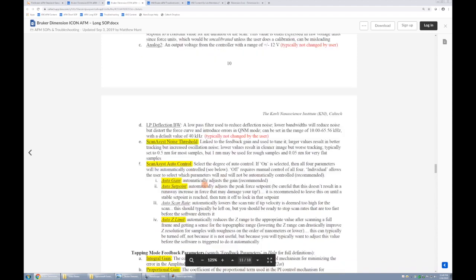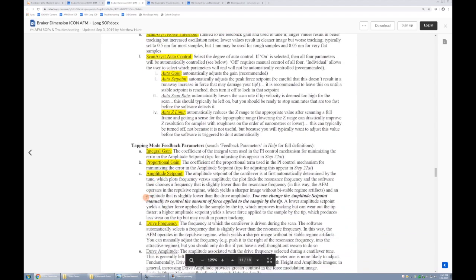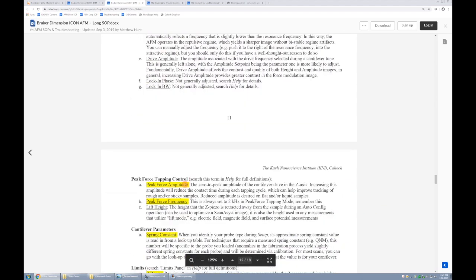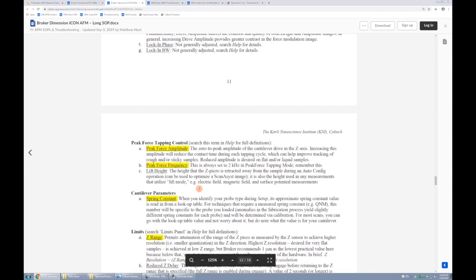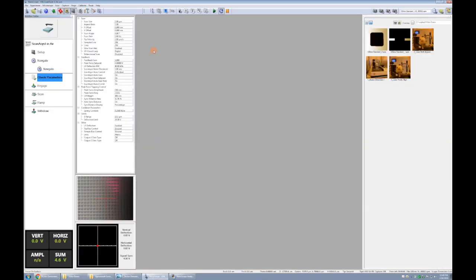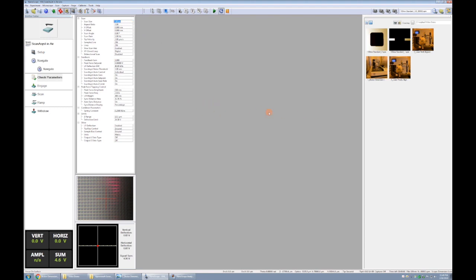We can go back into our user interface, and we'll go through the most important ones. We can start with scan size. One micron, that just means we have a one micron field of view in the x. Aspect ratio of one would mean that we would also have one micron in the y.